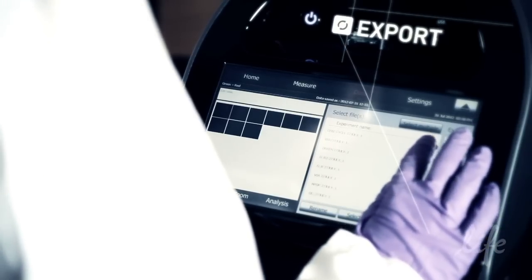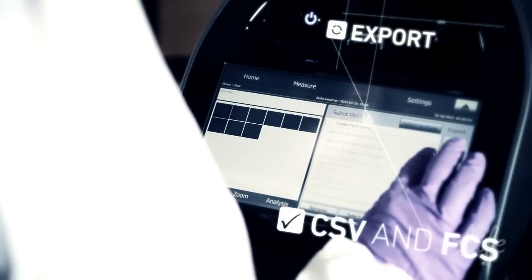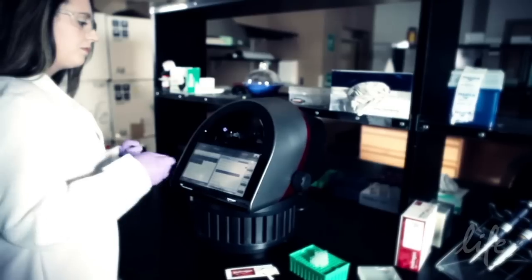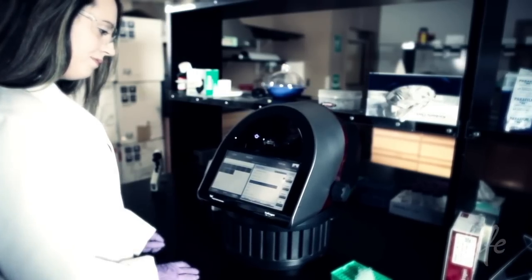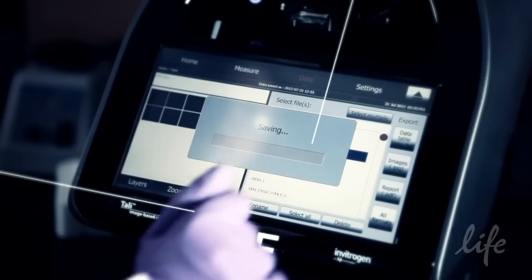You can also export comprehensive count data from each run as a CSV or FCS file, the images captured during the run as JPEG files, or the final report containing aggregate data and calculations as a PDF.